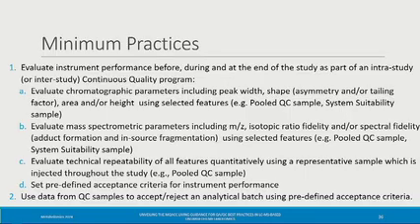That's how my lab does it, but as I mentioned, mQACC is leaving it open. If you prefer to do pre-extraction and use pooled QC to monitor that and you don't use internal standards, that's perfectly okay too. As long as you know what you are monitoring and what's reasonable acceptance criteria for the way that you are doing it, that's fine.